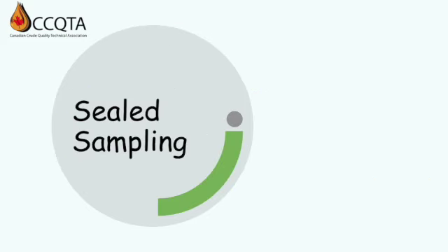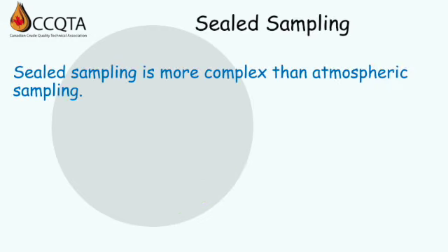Sealed sampling has less risk of exposure to atmosphere and as such less risk of loss. However, it involves more complex equipment and complicated preparation and sampling techniques. Sampling into an open container is relatively simple, as we've discussed, but has potential for sample integrity risks. Sealed sampling is the method of choice for maintaining sample integrity. However, it is more complex and requires a more skilled operator to execute properly.